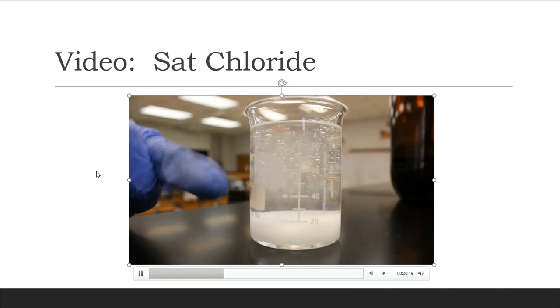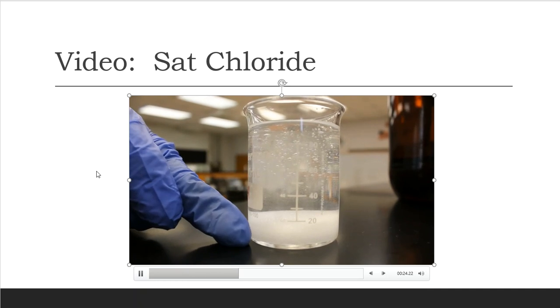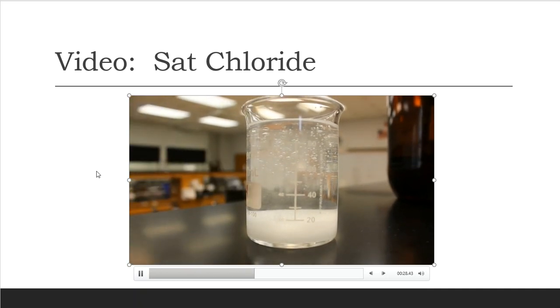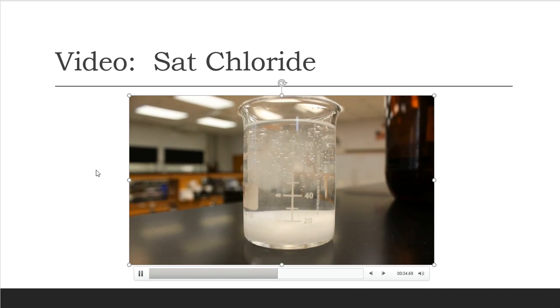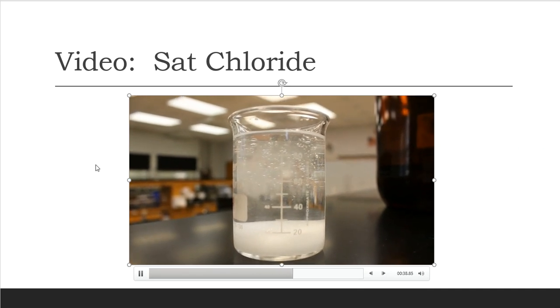And if it dissolves all of your sodium chloride down here at the bottom, you do not have a saturated solution. You have to use enough salt, in this case, so that you still have some left over at the very end. Imagine making Kool-Aid at home. Too much sugar falls to the bottom, but oh, how sweet it is. And the same thing is happening here with salt.